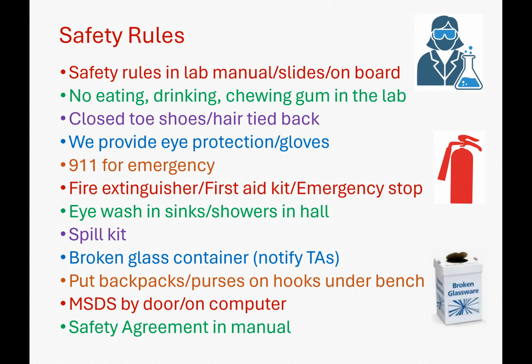By the door or on the computer, you can find materials safety data sheets to tell you about the chemicals that you need. And there is a safety agreement in your laboratory manual that you'll need to sign.